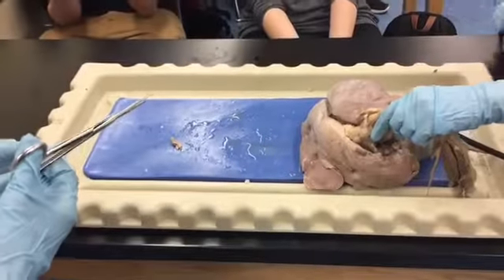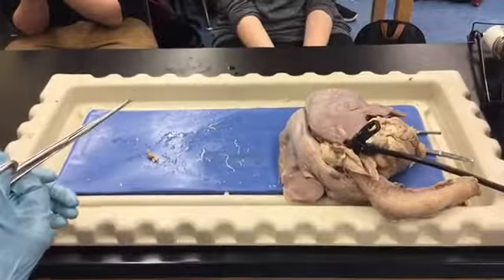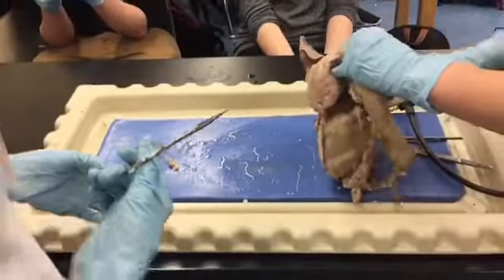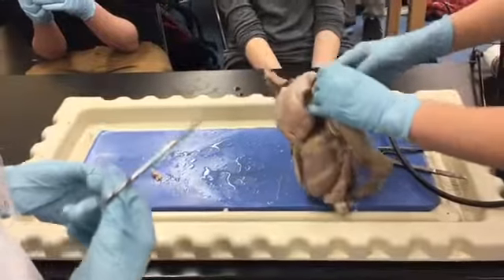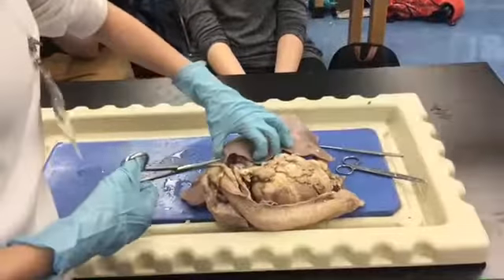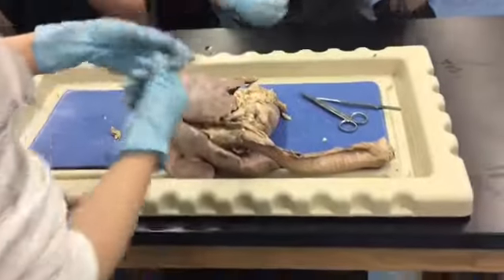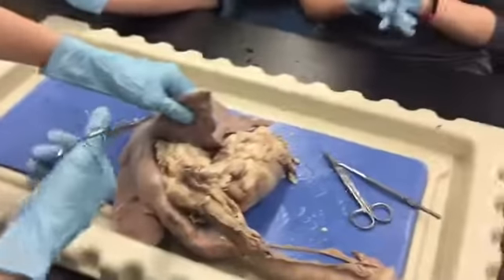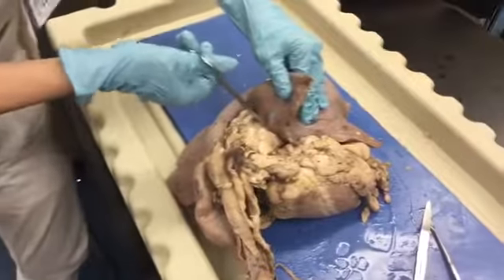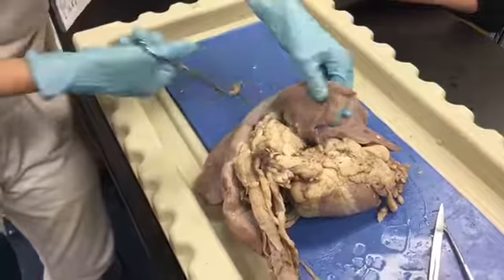Okay. So you guys have, alright, that's what it looks like. Interesting. Now at this point, what I would like you to do is to cut off the lungs. So cut right there, and then cut right there. Okay. Alright, guys. Here we go, we're cutting the lungs off. It just leads to the tissue.